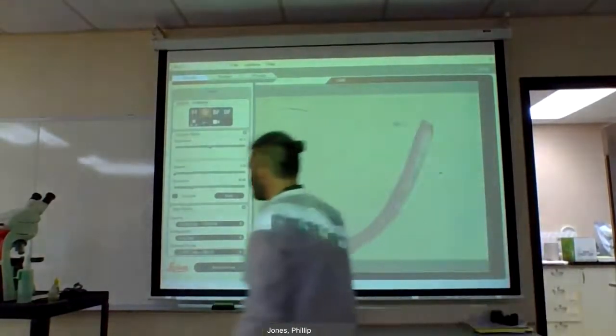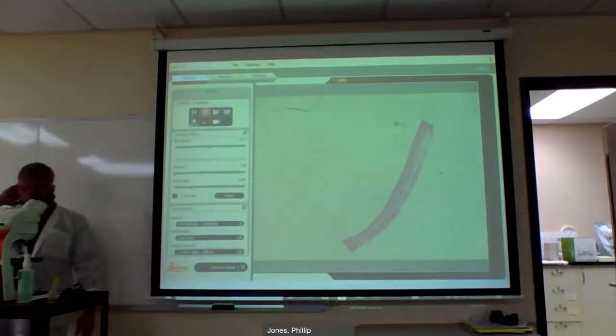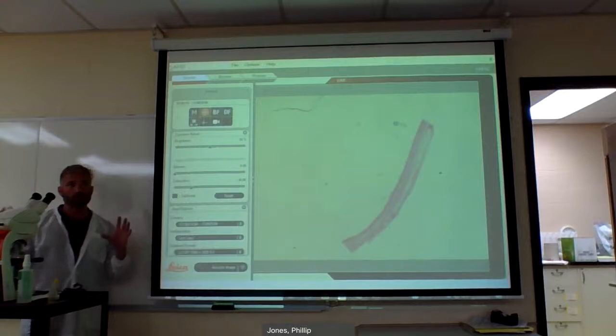Okay, so no swearing. I kind of want to go over the microscope today, show you how to use it. Remember, once we focus it on something with the coarse and the fine, you're never going to touch the first big knob again.